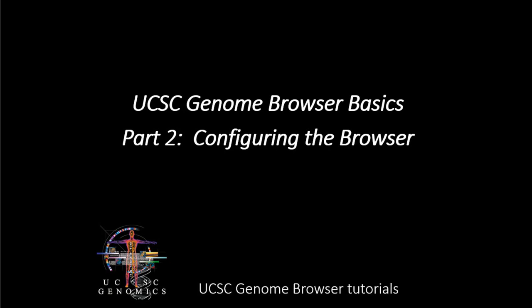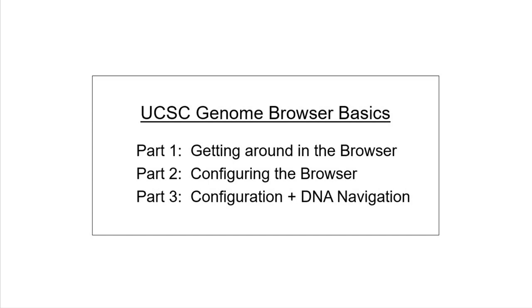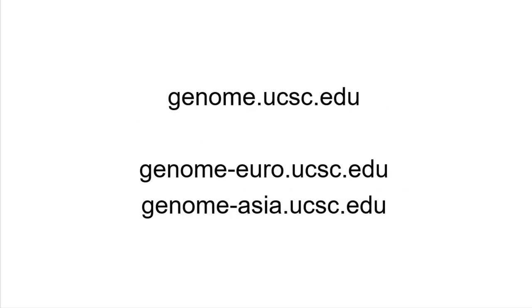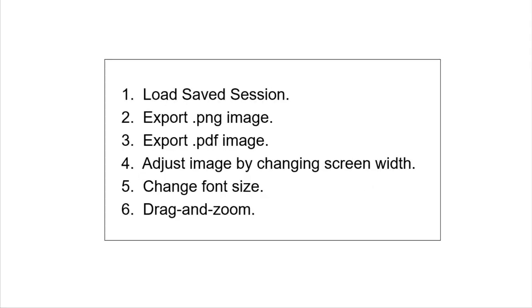Welcome to part two of the basic browser video series. In part one, we focused on the use of accession names and the many ways that identifiers of various kinds can be used to locate genomic locations and gene annotations. We also saw a few configuration options for setting up the browser. In this installment, we will focus on many more ways that the browser image can be configured to show the data the way you want it.